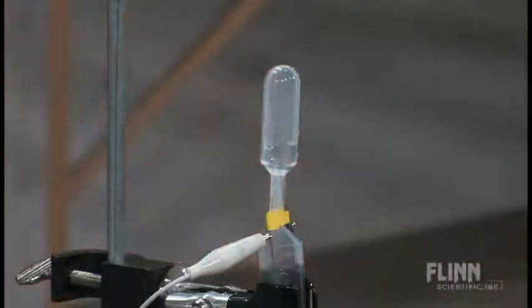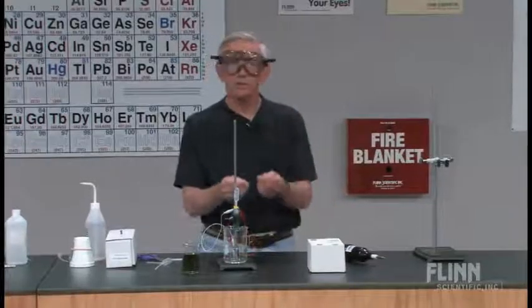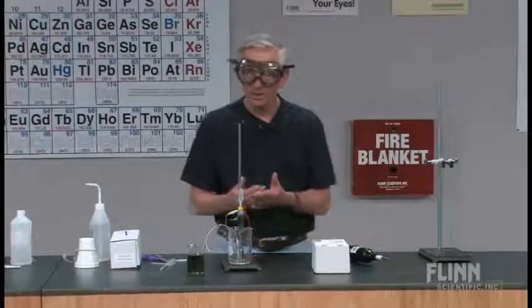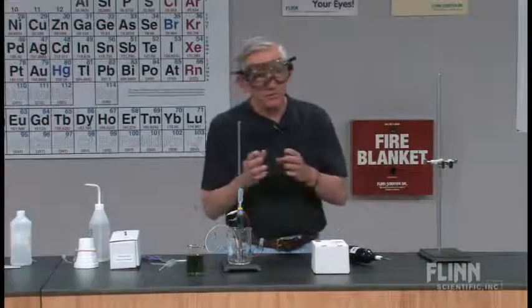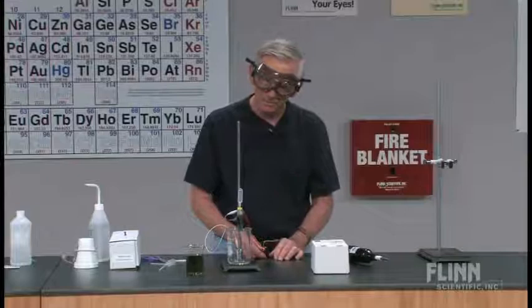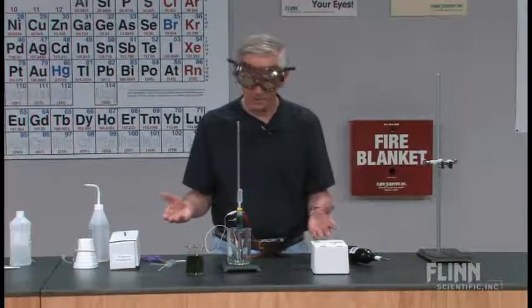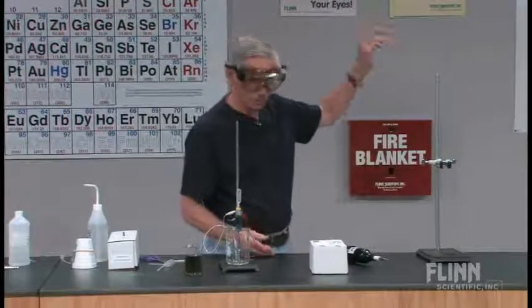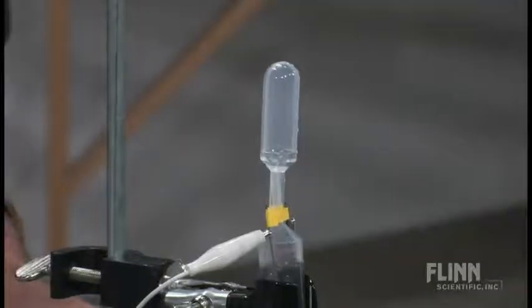If you have done Bob Becker's experiment with hydrogen and oxygen rockets, this is essentially the same thing. The only difference is, in that experiment, you start with different amounts of hydrogen relative to the amount of oxygen and look for the optimum combination. Presumably, I'm getting the optimum combination. I should be getting two parts of hydrogen for one part of oxygen. We're getting pretty close to our goal here.